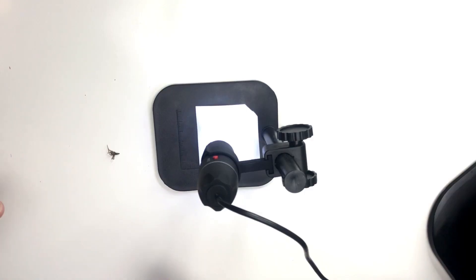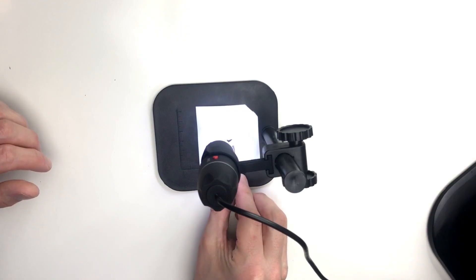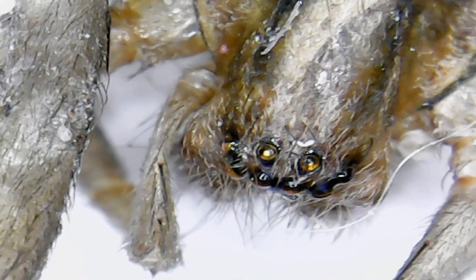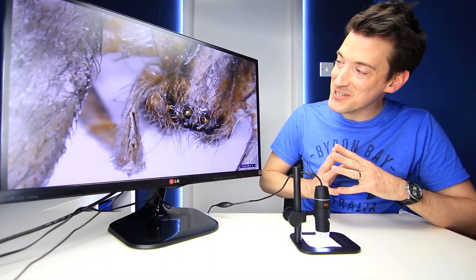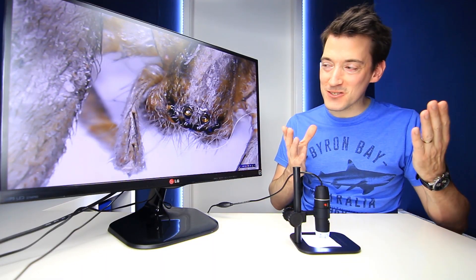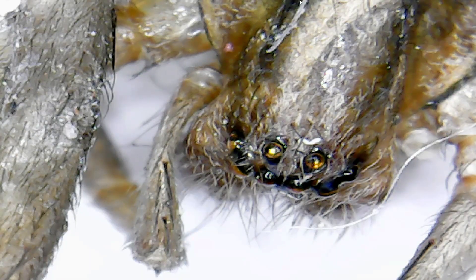Now this is something I've been quite looking forward to having a look at. This is a half a spider — a dead one — but he's still got his body intact and a few of his legs left. So let's have a look at this spider. Oh my word, look at that — that's his eyes, that is the spider's eyes, you can clearly see that. That is just phenomenal, I can't get over that, that is just amazing.